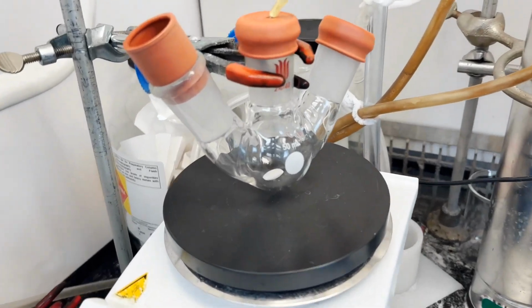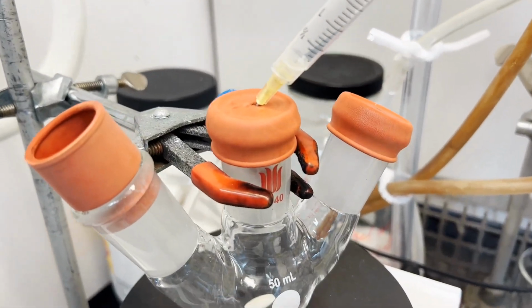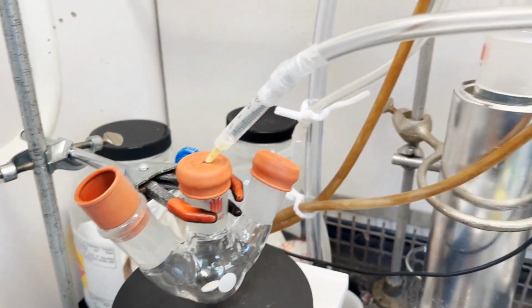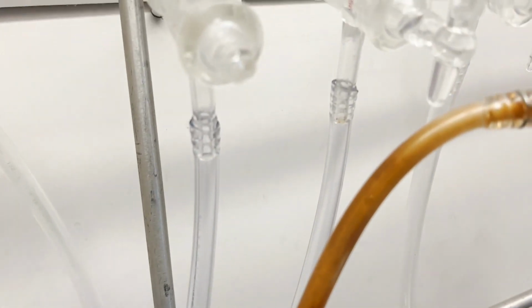Hi everyone. So here I'm going to show you how to set up a Schiff base reaction, how to work up the reaction, and what precautions you need to take care of during workup, NMR check, and purification. So let's see how I'm going to set up the reaction here. I have taken a 3-necked round bottom flask equipped with a magnetic stir bar and 3 rubber septa. You can also use a 2-necked flask, it's fine.